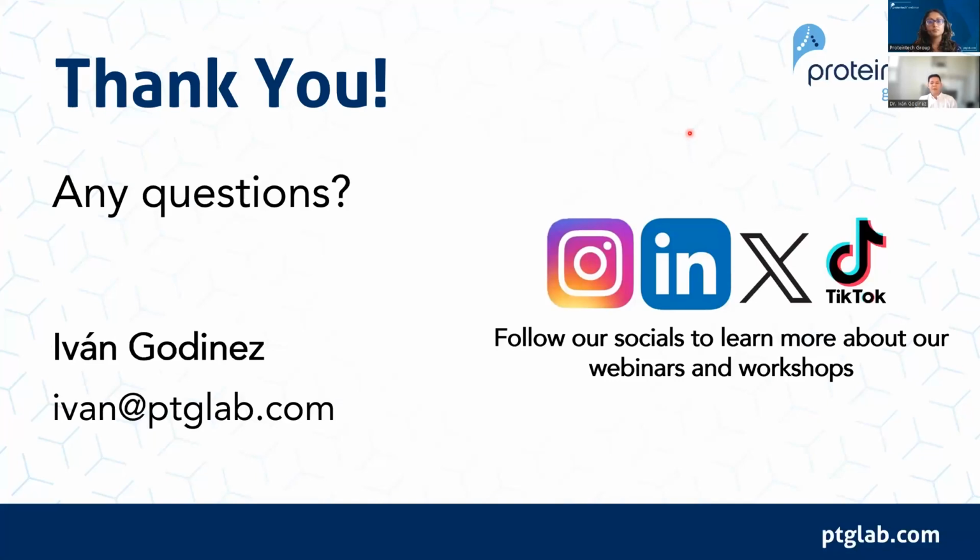There are some practical things to consider though. If you go really high, like say 500, 600, 700 antibodies, you're introducing a ton of protein into a given cell, right? So the amount of blocking and so on needs to be optimized for those larger types of experiments. But in terms of just theoretical overlap, we're not really concerned about spectral overlap or anything like that.